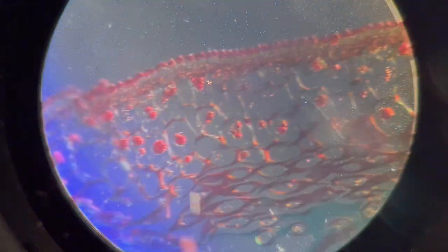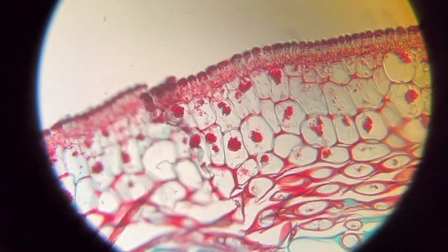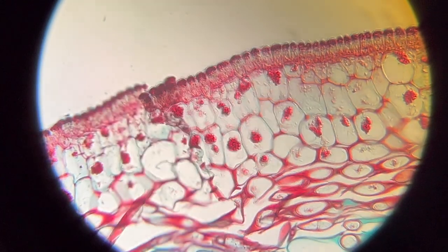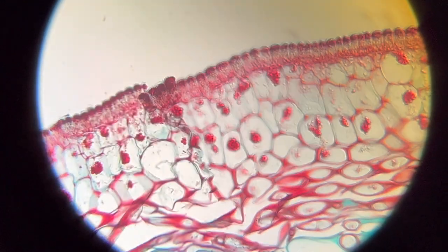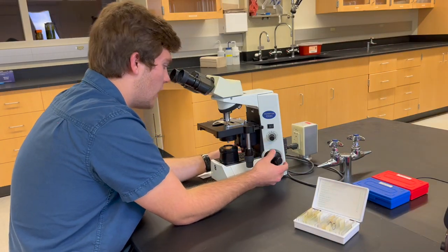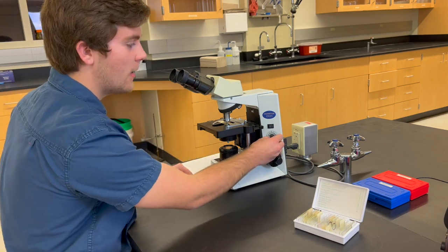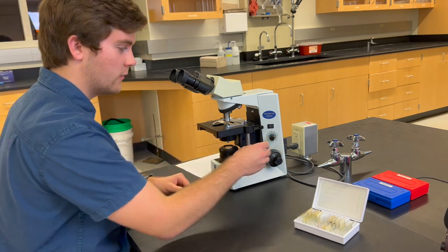We can now move on to the 40x lens. Again, rotate the nose piece to the 40x lens. Keep in mind, on some microscopes there is also a 100x lens, but that is only for oil immersion. Generally, as the magnification of a specimen increases, the more light you'll need in order to even see it. So keep that in mind when you're moving through the different objective lenses.